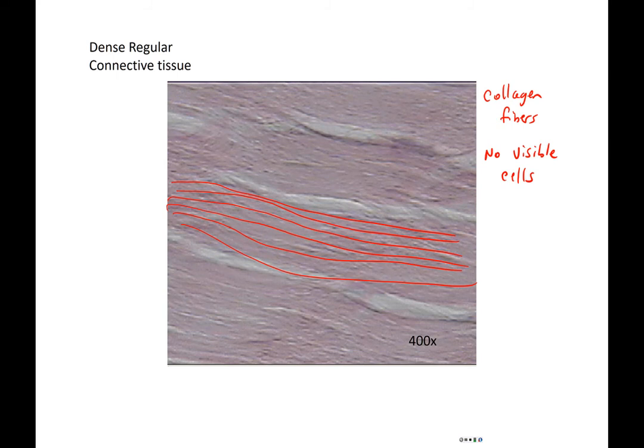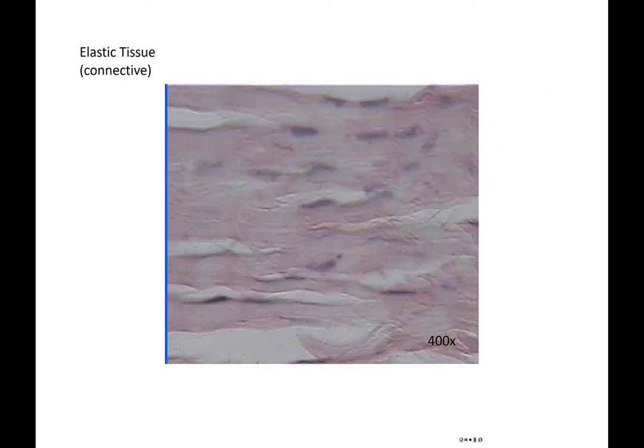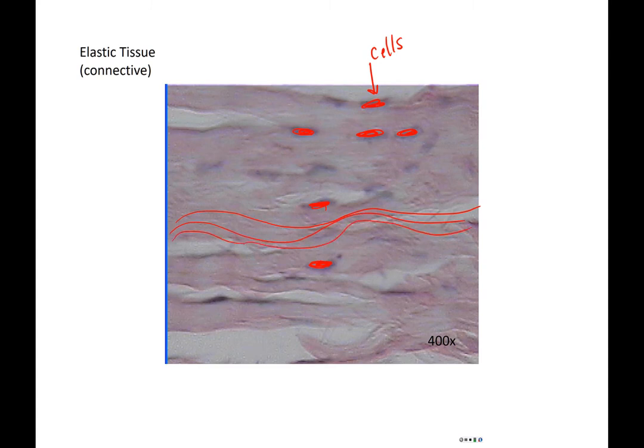Tendons and ligaments are also composed of the elastic tissue, and here you will see visible cells, so that's going to be a really good way to help differentiate between these two tissues. There's a little bit more of a curvature to these fibers as these are the elastic fibers, so they have a little bit of a stretchiness to them. I like to think about sort of a relaxed rubber band.